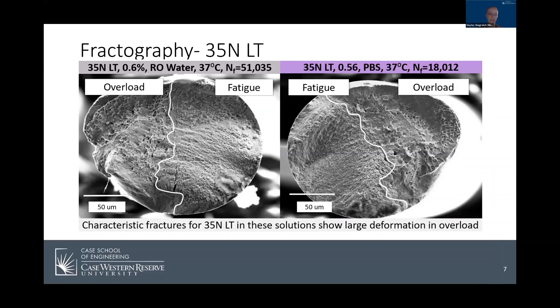Following these tests, the fracture surfaces were examined using scanning electron microscopy or SEM. This image shows two specimens of 35 NLT at 0.6% strain — the specimen on the left was tested in RO water and the one on the right in the PBS solution. Both specimens show fracture surfaces that I would expect from this type of test. On the right side of the line in the left image is the fatigue region, characterized by striations running through the region. This is where a crack started at a non-metallic inclusion and then propagated as the test continued. When the sample eventually failed catastrophically, it created the overload region, distinguished by a dimpling pattern. My analysis of several specimens of 35 NLT tested in RO water and PBS at several strain amplitudes showed the same pattern.